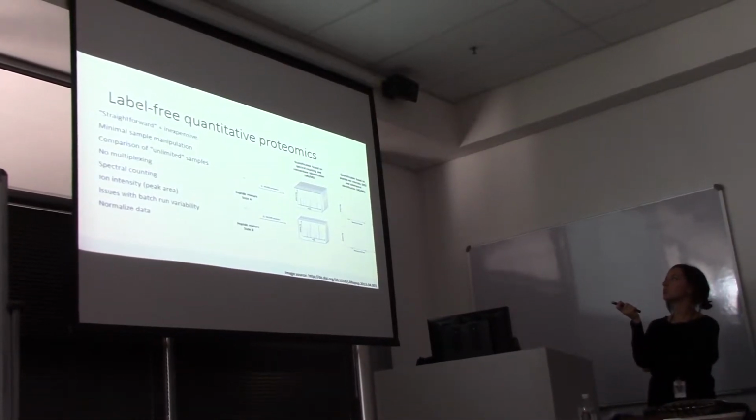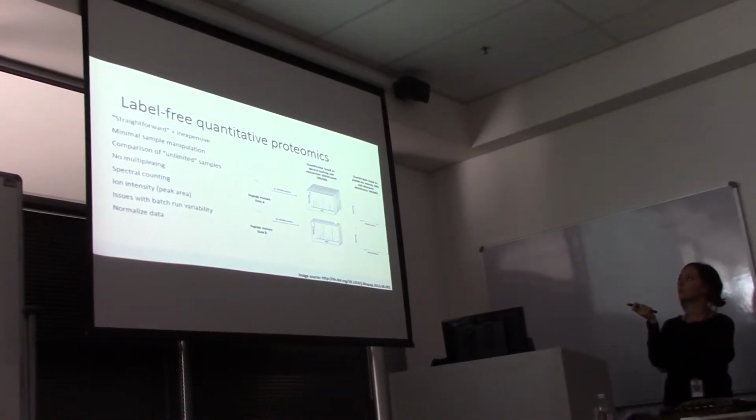So you can either do a spectral count, so based on the number of spectra.